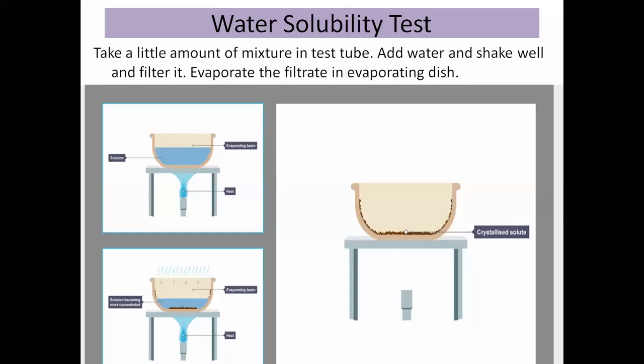This step is important because if one compound is water soluble, it will take time to dissolve in the water. So you have to shake it well for at least 2 to 3 minutes, and then you have to filter it. Normally you will filter it into an evaporating dish. Then you have to evaporate that filtrate.